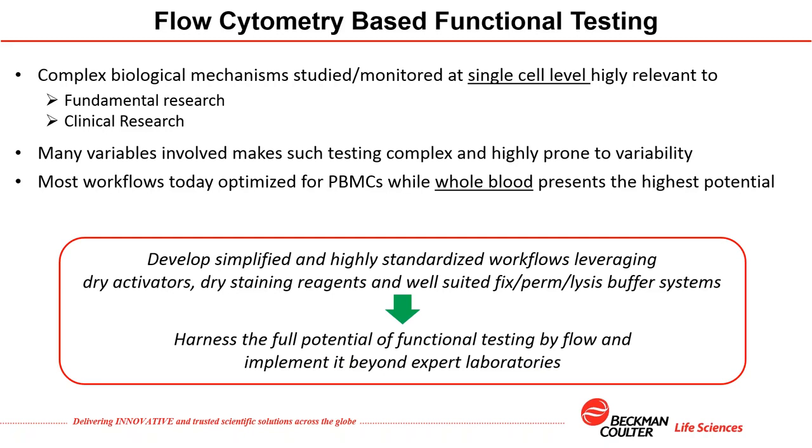So our endeavor in that context is to try to develop simplified and highly standardized workflows so that the full potential of this functional testing by flow cytometry could be fully harnessed, and that it could be brought beyond long-term advocates or expert laboratories.